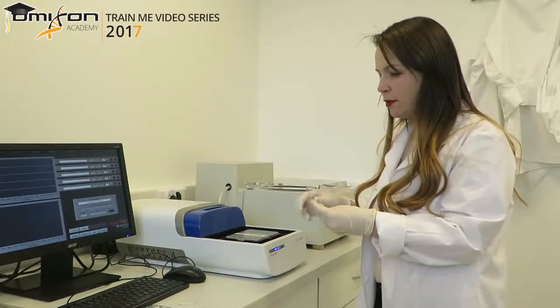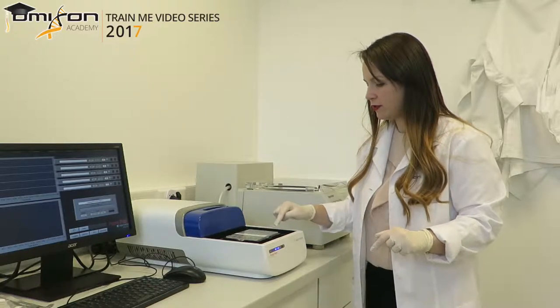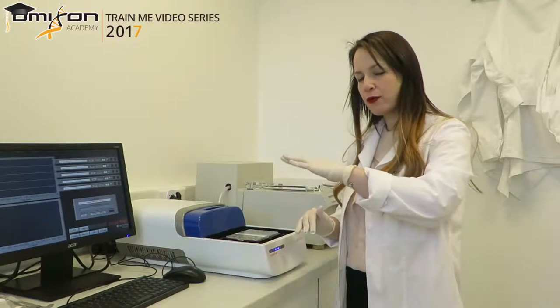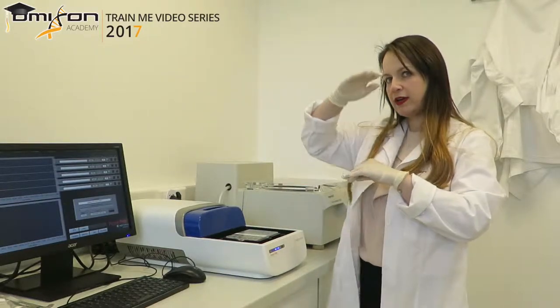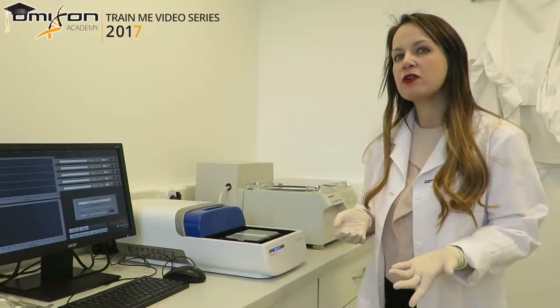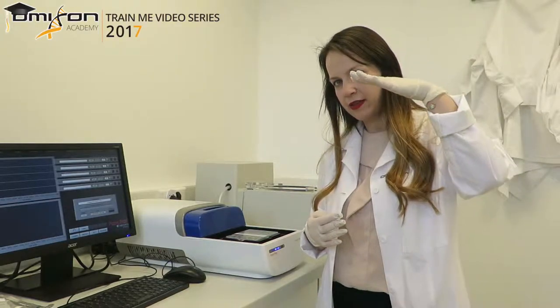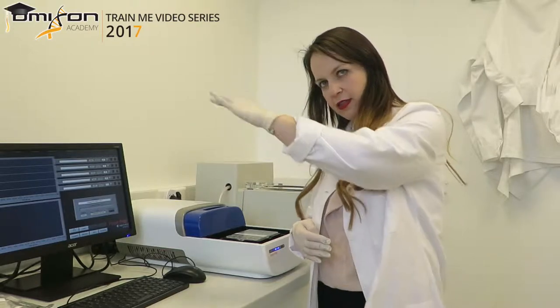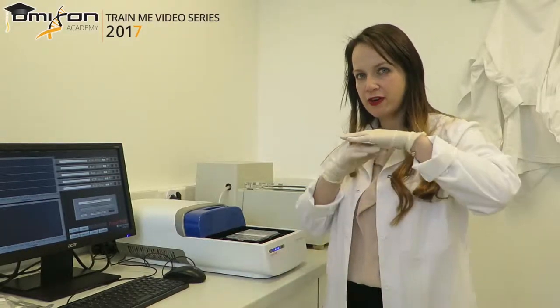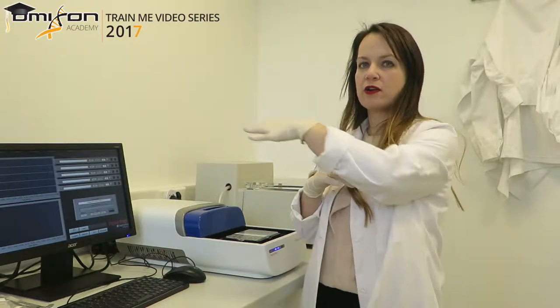The next step is to refill the ports for the electrodes with buffer. If buffer is missing for more than three-fourths of the space, you definitely want to refill it up to the same level as the plastic. As with any typical electrophoresis, if you don't have enough buffer, the current will start running and then drop off, making electrophoresis inefficient. You want to make sure there is enough buffer in all lanes so that current flows evenly across the entire run.